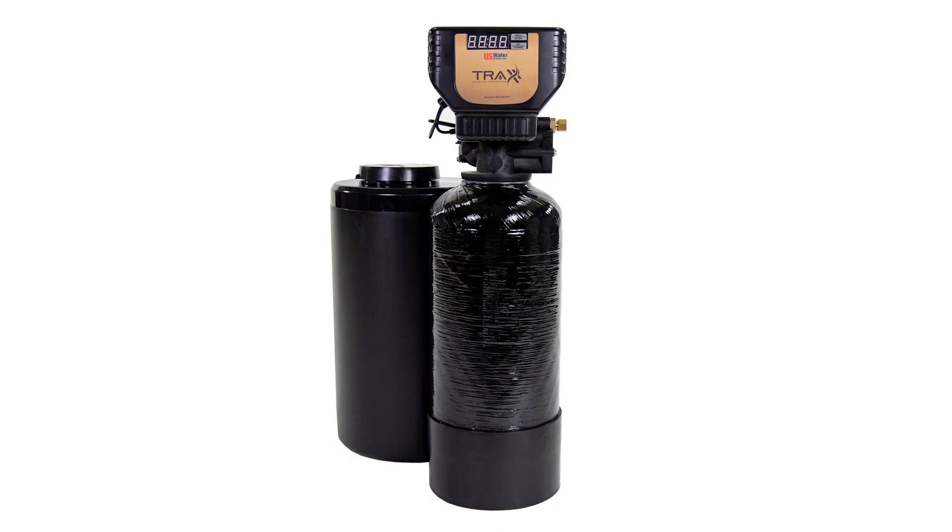If your water is more than 200 parts per million, then a water softener will likely help increase the filter and membrane life and reduce the cost of producing DI water. Many facilities already have a water softener, but if yours doesn't, we have a mini water softener for applications such as this. It's called the TRAX Mini, and it's designed to pre-treat water in labs or other small areas.